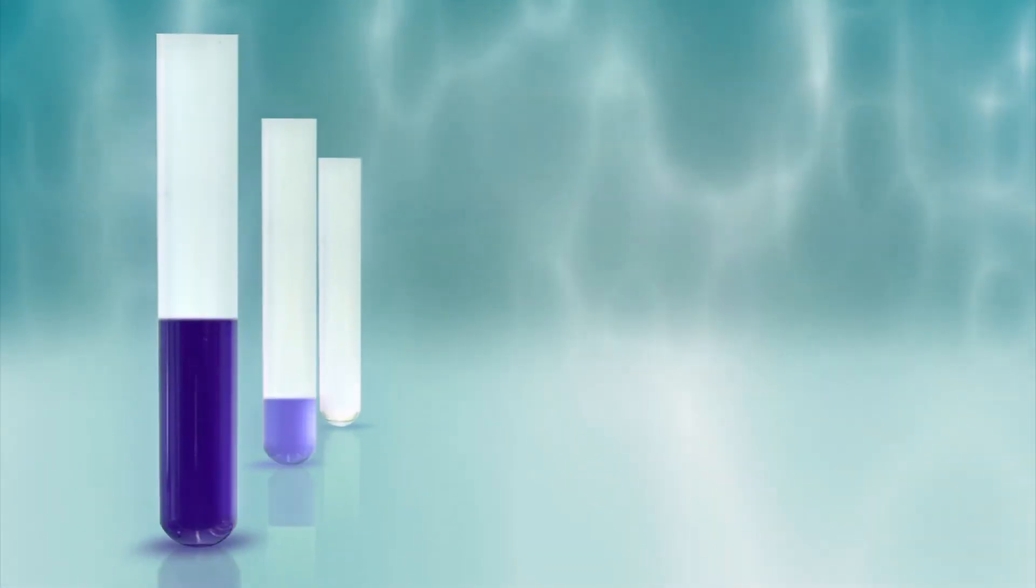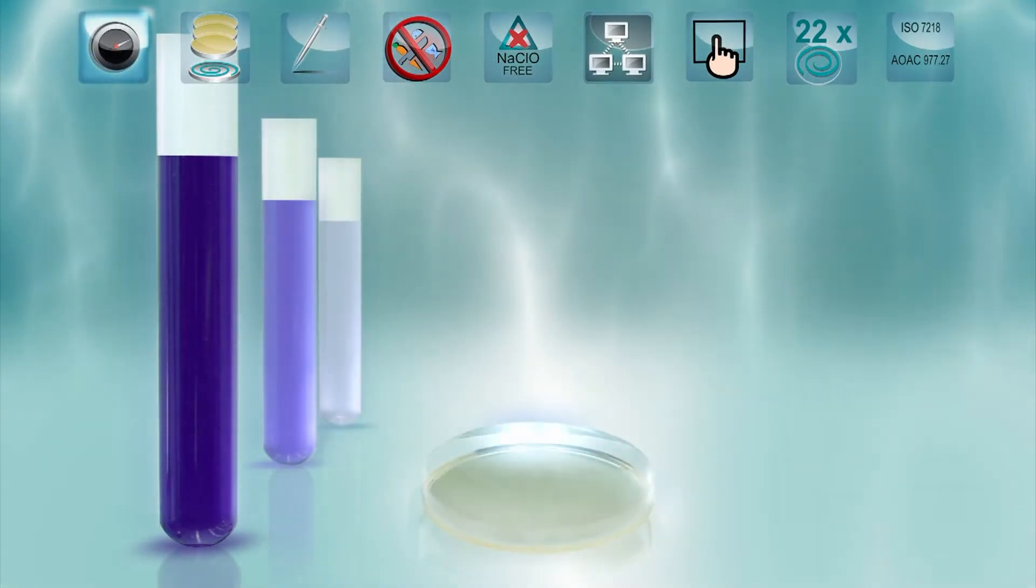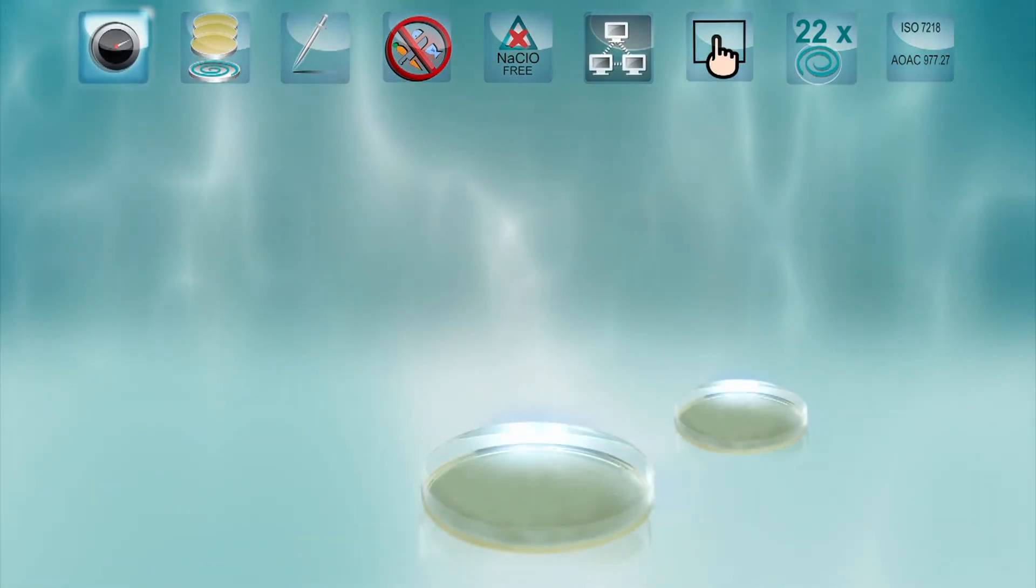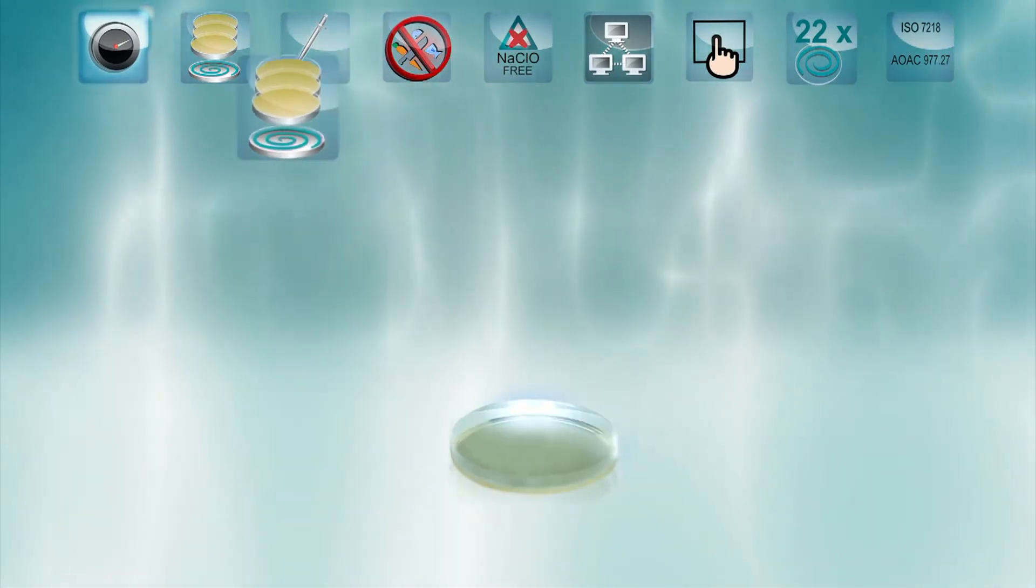The spread plate technique requires time-consuming serial dilutions. Spiral plating offers an alternative that reduces the time and Petri plates required. A single spiral spread spares the inoculation of three Petri plates.